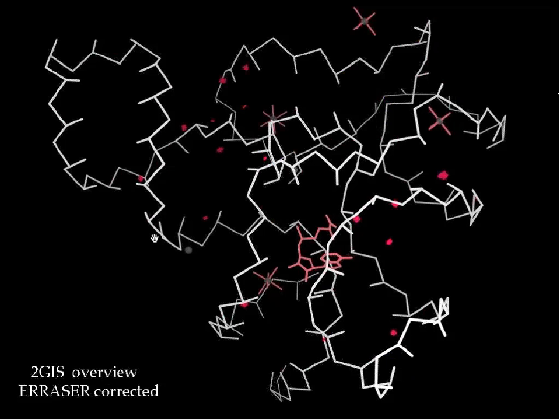So again, one of the neat things about this is that we've discovered, we think, the reason the geometry is so hard to get ideal for RNA is that there are things fit in the wrong local minimum all over the place, like incorrect puckers and backbone twisted the wrong way.